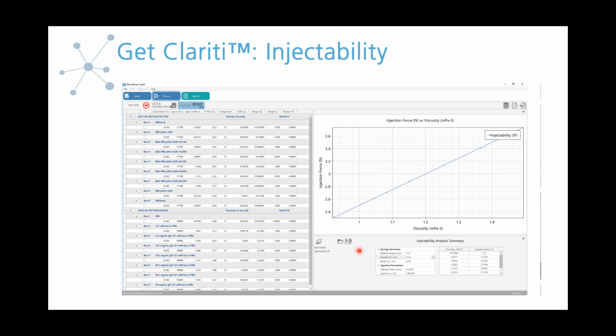At the moment, the Clarity software only handles the Newtonian case, which we just talked about. So it's using that expression that we derived. Again, it's not going to be including the friction. At the moment, it does not yet have the means to handle non-Newtonian samples.